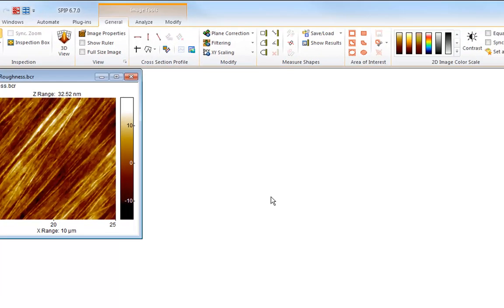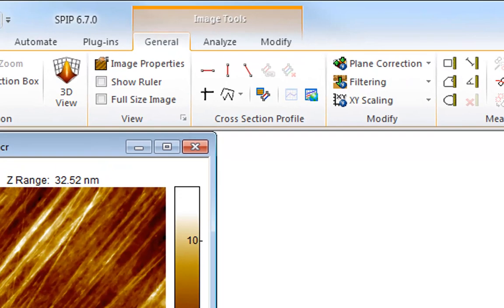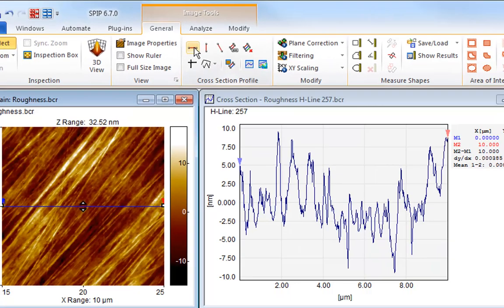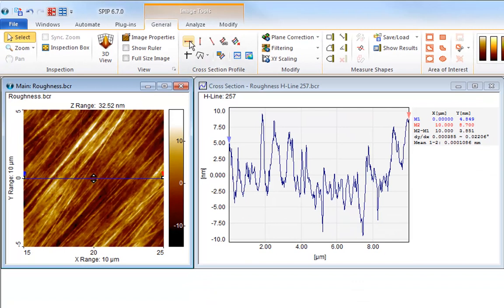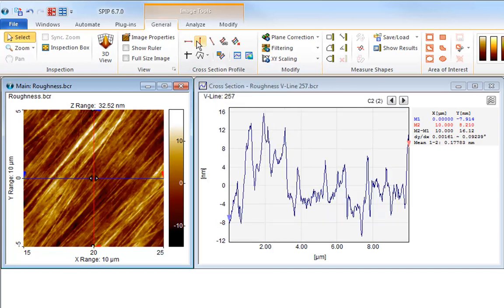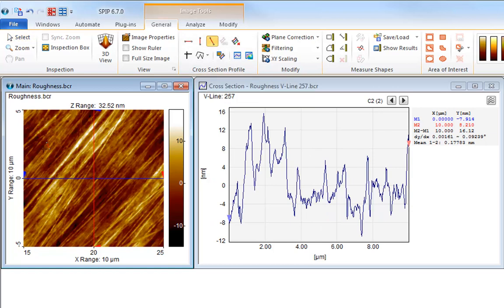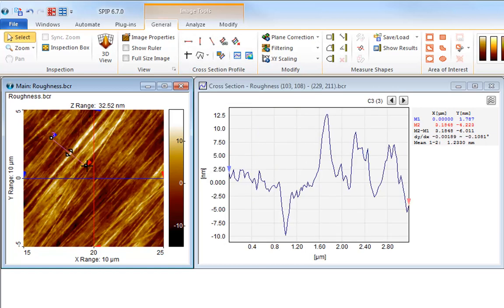Let's have a look at the cross-section profiling tools. To draw a cross-section in an image, simply select one of the profiling tool buttons. This tool will place a horizontal profile in your image, and this tool will place a vertical profile. And finally, this tool will let you draw a profile of any length and direction.